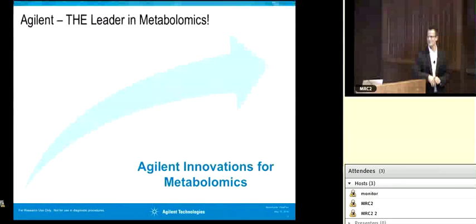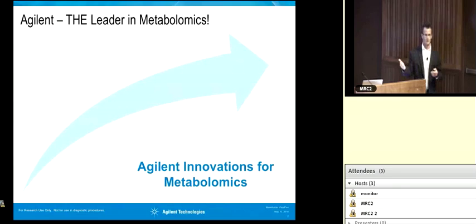So, isotopic fidelity. That's the ability to accurately measure abundances. That's to be able to take fumarate at C12 and say that C12 is 98.9% and the C13 peak is 1.1%, and do it accurately every single time, because we're measuring the incorporation over time of isotopologs. So these are going to go up, they're going to go down. If our accuracy here is 5% or 10%, that's directly correlated to our results.